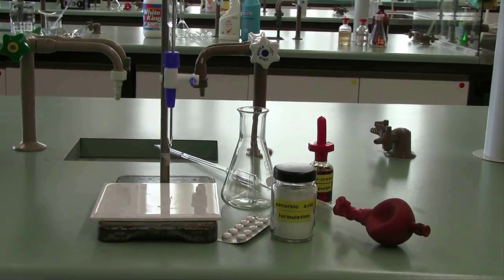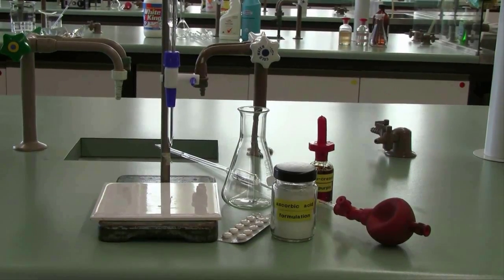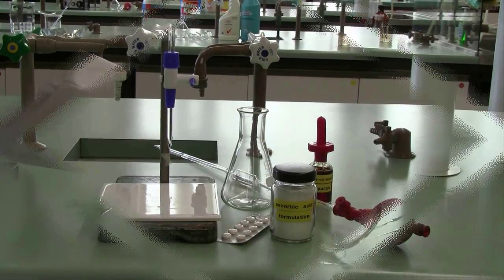Today's experiment is also designed to reinforce your analytical techniques in the lab. It will give you another opportunity to perfect your use of a pipette, to complete a titration, and to weigh out a solid analytically by difference.